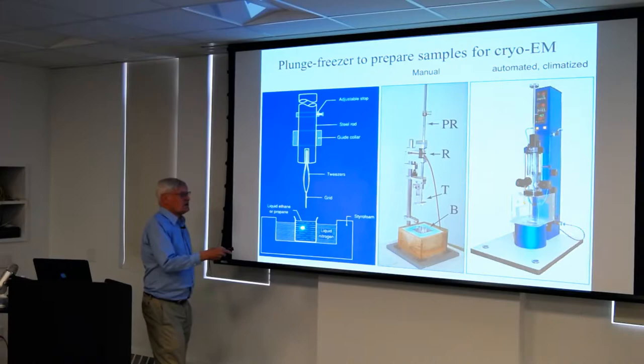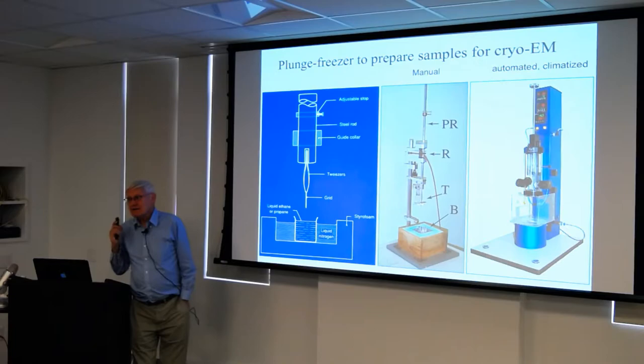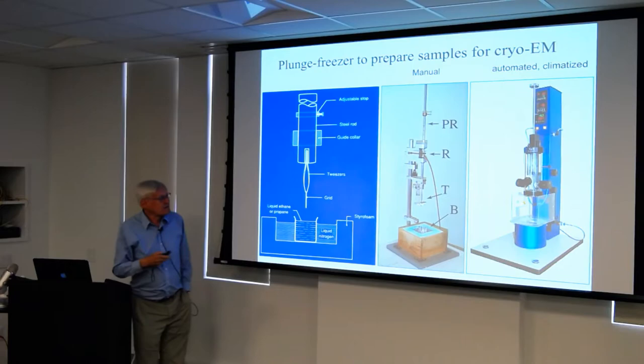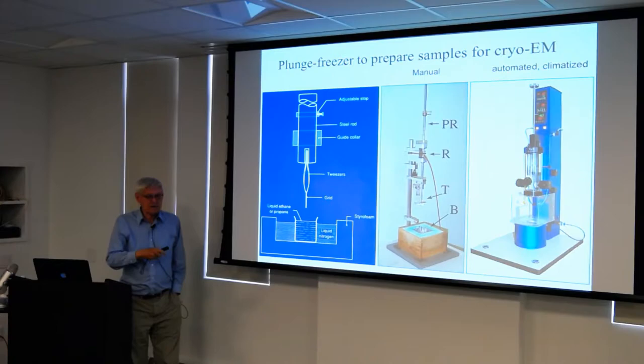Why is it not directly plunged into liquid nitrogen? Does anybody know? Thermal conductivity is too low. Pardon? The thermal conductivity is too low. Yeah, that's exactly right. And it's not the liquid nitrogen that is the trouble, it's the gaseous nitrogen, it's the bubbles that form when the specimen enters.